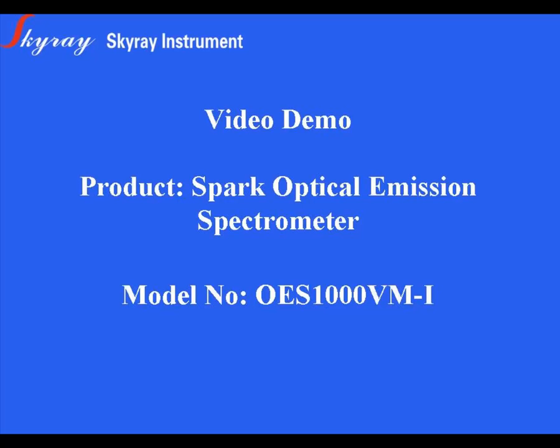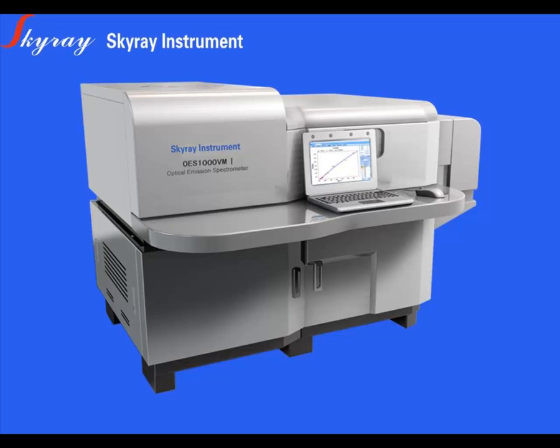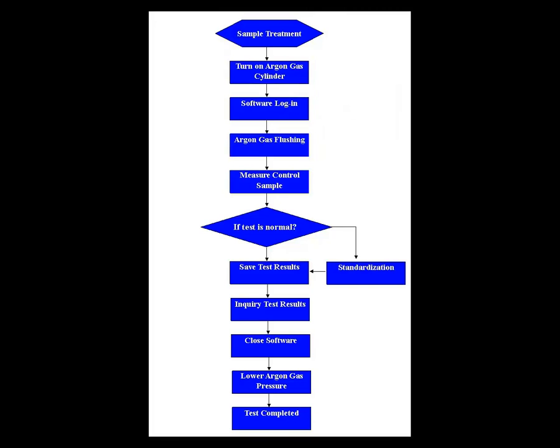Welcome to watch OES1000 Spark Optical Emission Spectrometer video guide. Let's take a look at the operation flow chart.